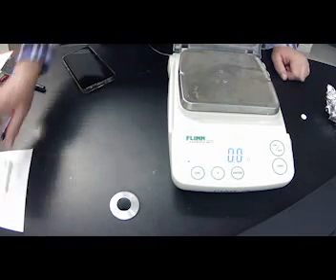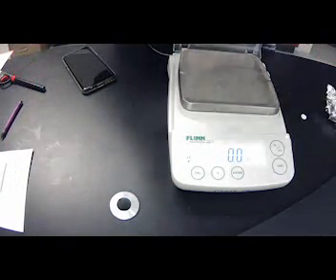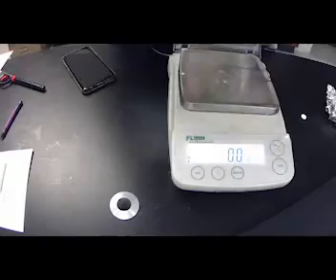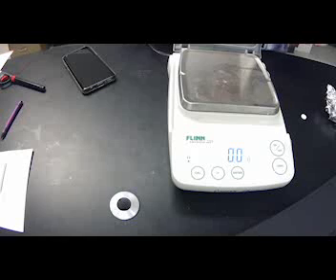All right. Now we're on the data collection for part 3. And we're going to do aspirin, wood, and aluminum foil. So we're on procedure part 3 now. And here is our data table we're going to collect. And so I'm going to do aspirin, wood, and aluminum. You will calculate molar mass and number of moles.